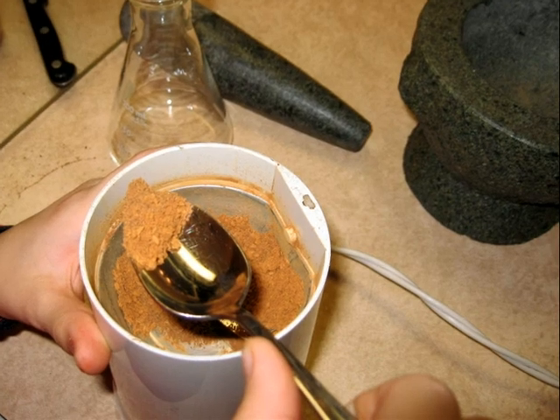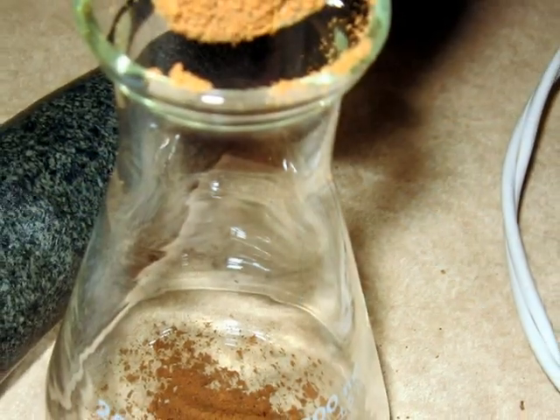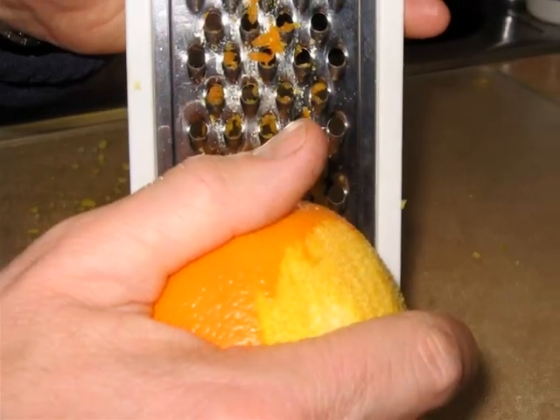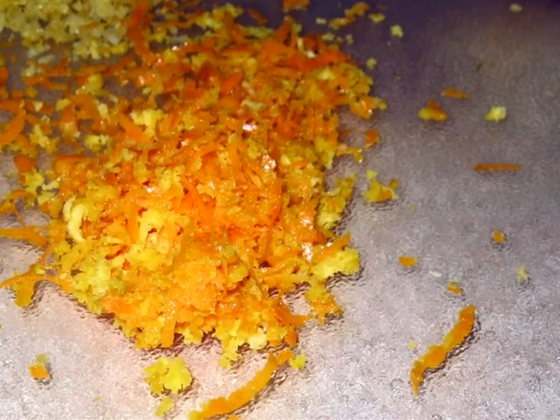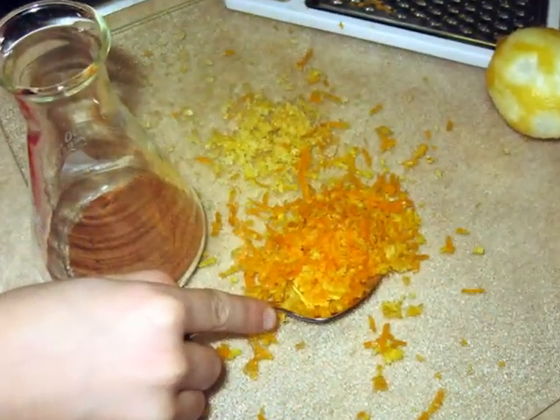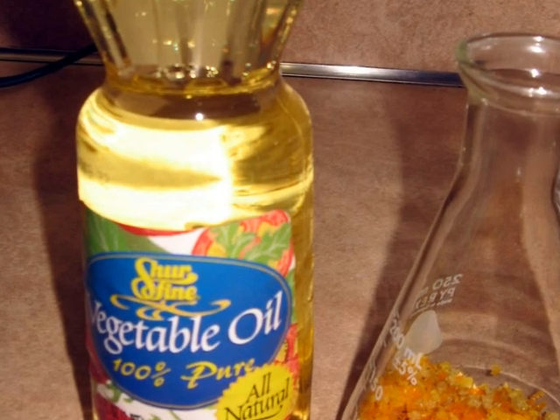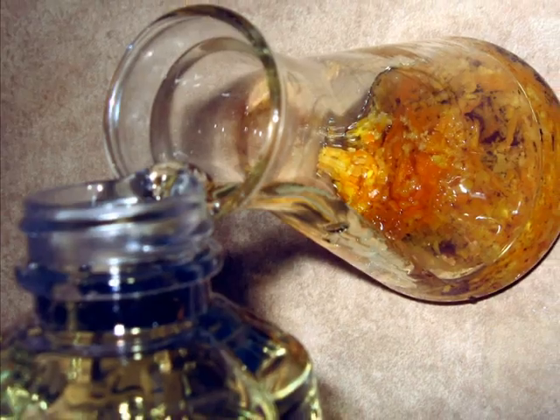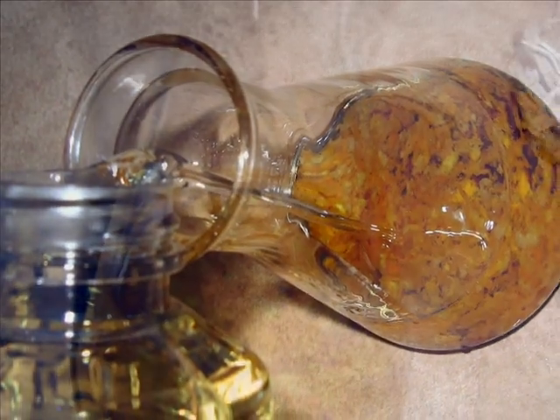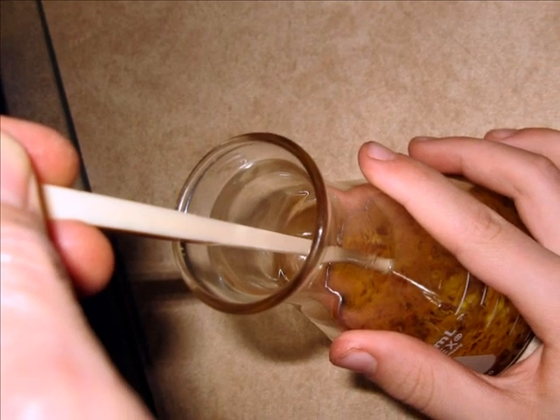You'll next want to place your raw material into the flask. You can mix more than one substance if you'd like. Next, add just enough vegetable oil to cover the raw material that's in your flask. You will want to mix the fragrant material and the vegetable oil thoroughly.